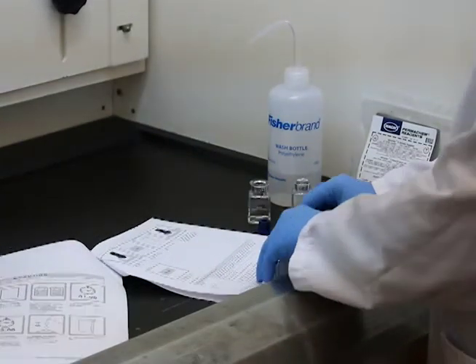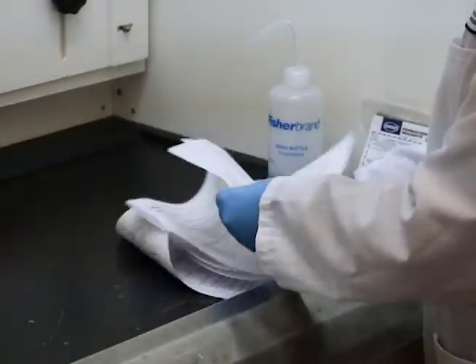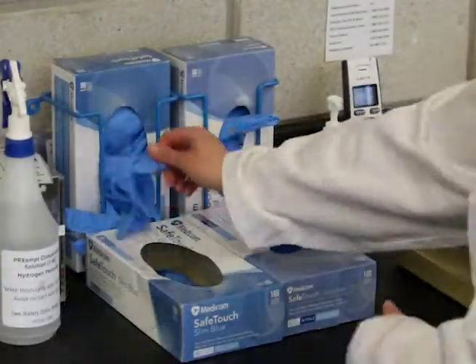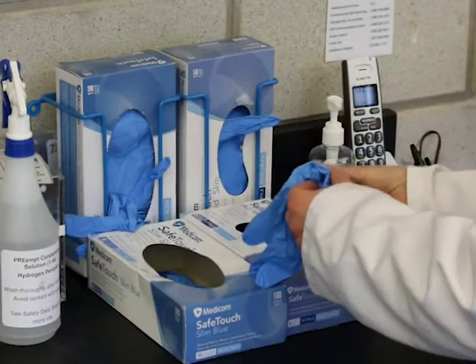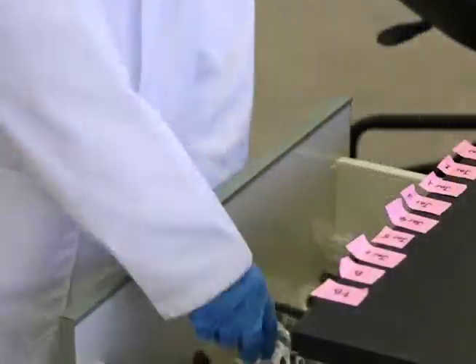You should always refer to the methods provided by the manufacturer of your instrument. It is important to review the safety data sheets for the chemicals that are used and to use the recommended personal protective equipment.